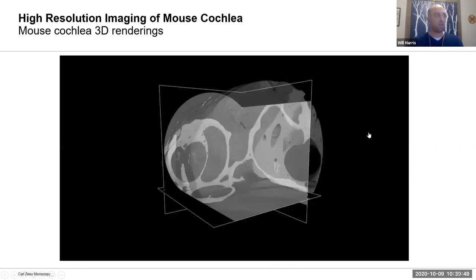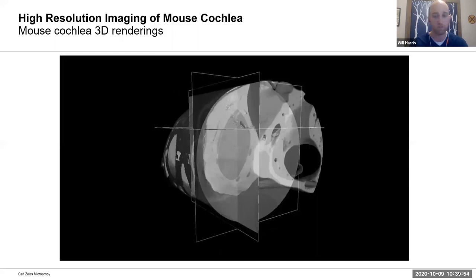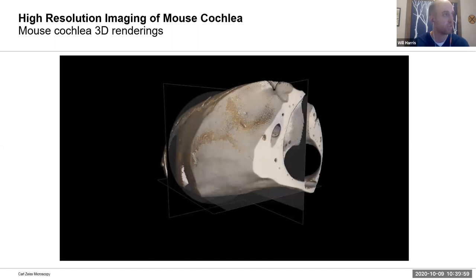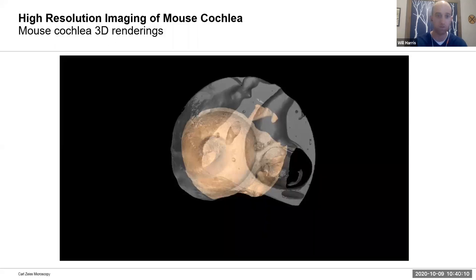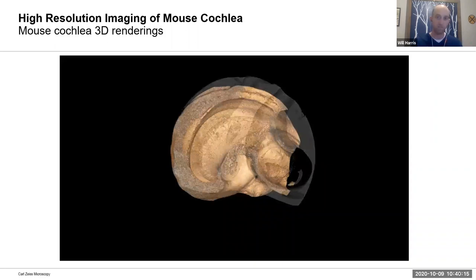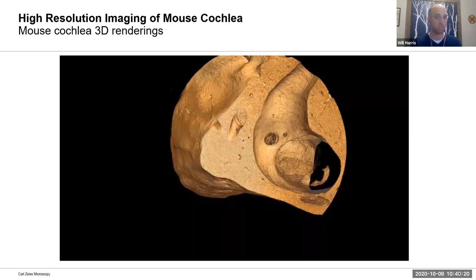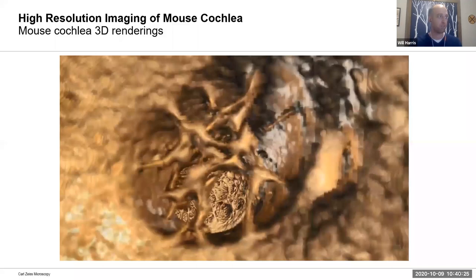We've also looked at some rather elaborate natural structures — this is a mouse cochlea, a dataset we ran with Stanford about four years ago. I like this video just because it shows the incredible amount of structural variation and complexity that we can see in the natural world. As a mechanical engineer by training, I appreciate this for bio-inspired design and biomimetics — learning from the structures we see in the natural world.